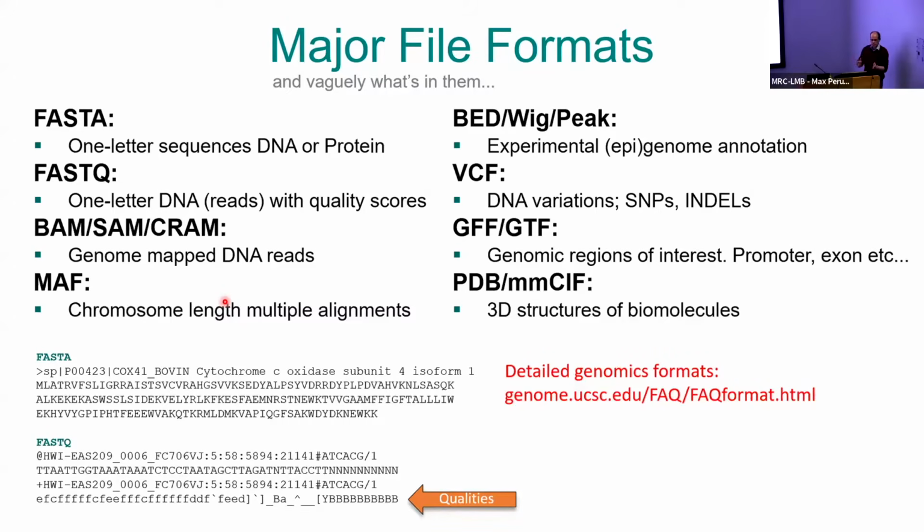This just essentially stores the location of where each read maps against your reference genome. There are different file formats as well. There are file formats for mapping, comparing multiple chromosomes to one another, or for when you're looking at genome browsers and you see the little peaks, those termite mounds on genome browsers that represent ATAC-seq peaks. These are in this wiggle format here.